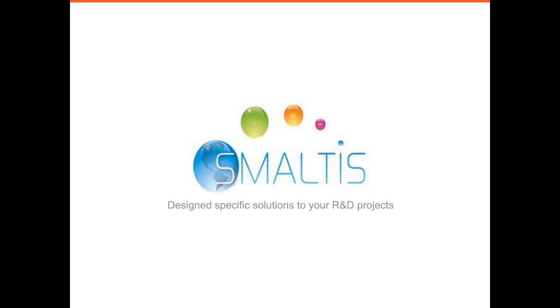And in the second part, I will present you some of our services where we analyze live bacterial cells, and how the Tecan reader improves our capabilities.